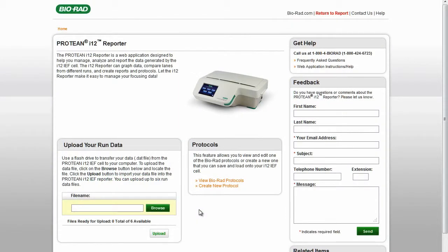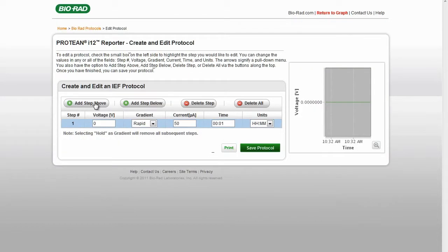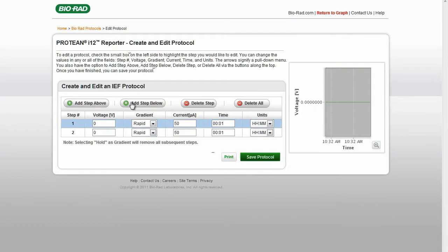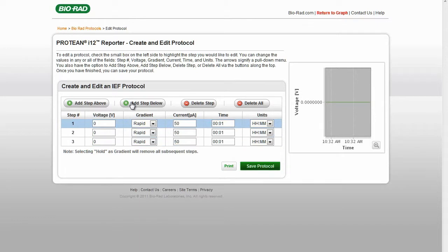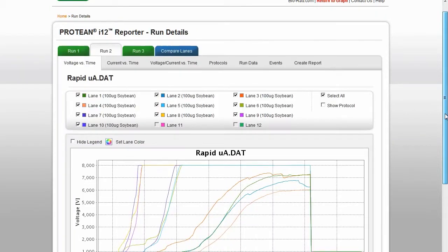The PROTEAN i12 Reporter is a free, web-based application that enables the creation of protocols and the display of run data files on a remote computer.